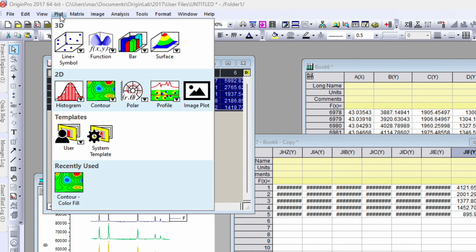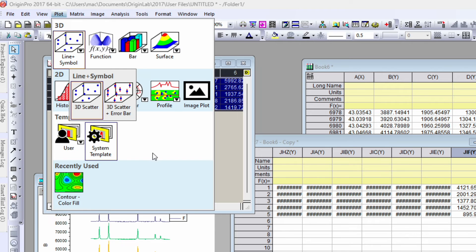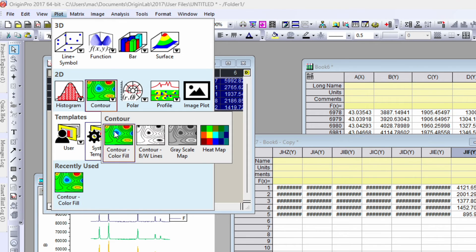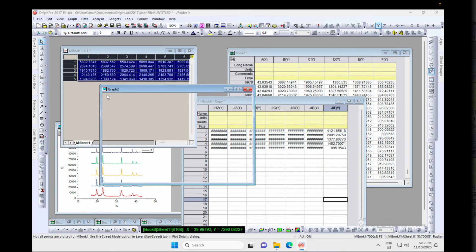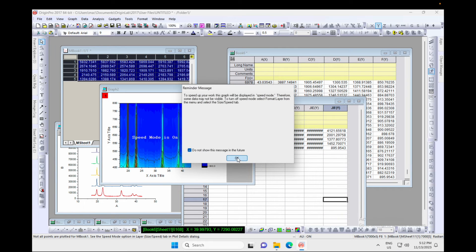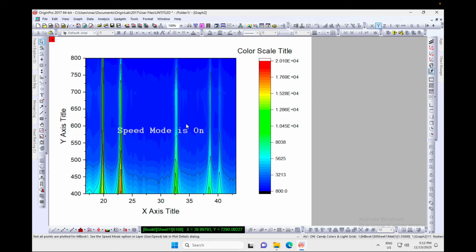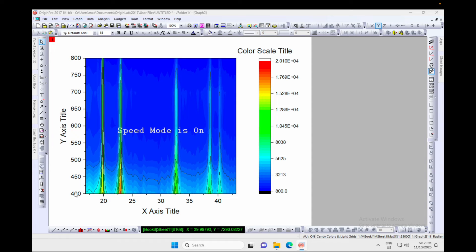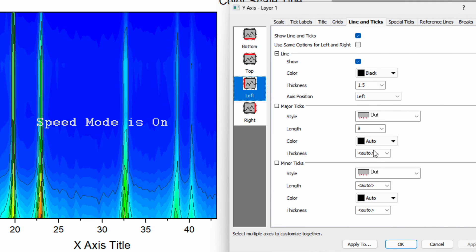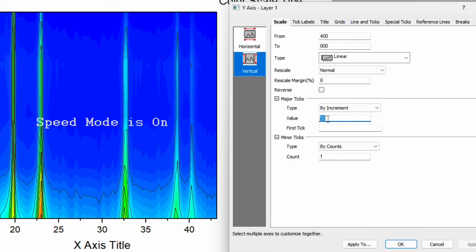Go to the Plot section, choose 'Contour', then select 'Color Contour'. Click 'Do Not Show' to dismiss the dialog. This produces the 2D plot where the y-axis is temperature and the x-axis is 2-theta. Double-click on the y-axis scale bar — the ticks are currently inward, and I want to change the value interval from 50 to 100 degrees. Click OK.